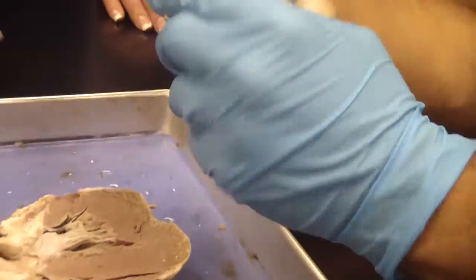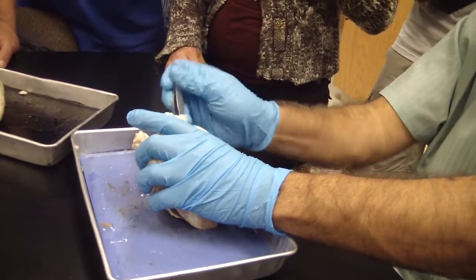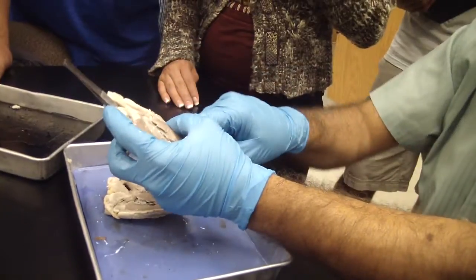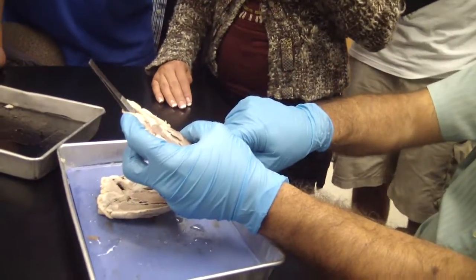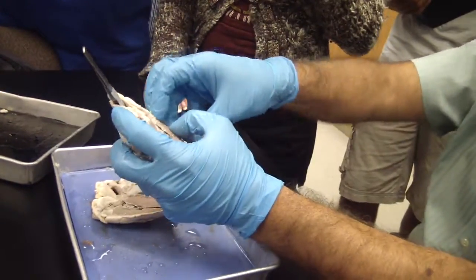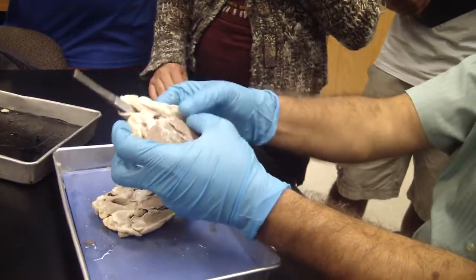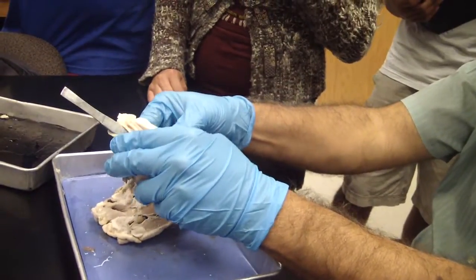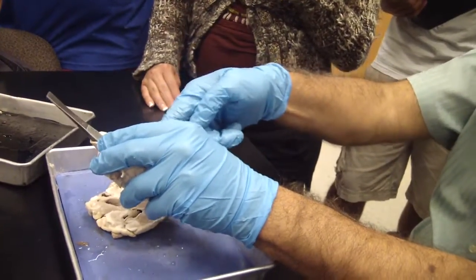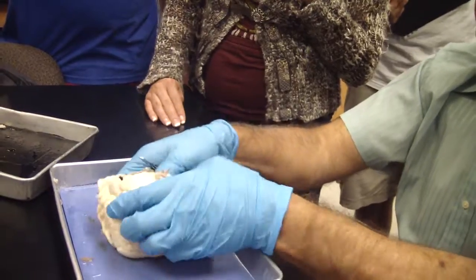No, because remember, that's the pulmonary artery, which goes from the right ventricle, right? This is the right atrium, and that's the right ventricle. And if you really want to see the pulmonic semilunar valve, then you have to cut this. We don't want to do that, guys. As it is, they have already. Okay, but take a look.